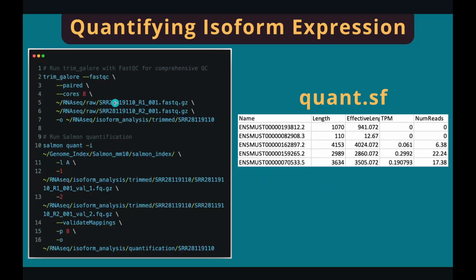Step 1. Trim the adapters using trim-galore as we did before. Here we have 2 FastQ files, R1 and R2, for each sample. Make sure to store them in a properly named output folder over here.